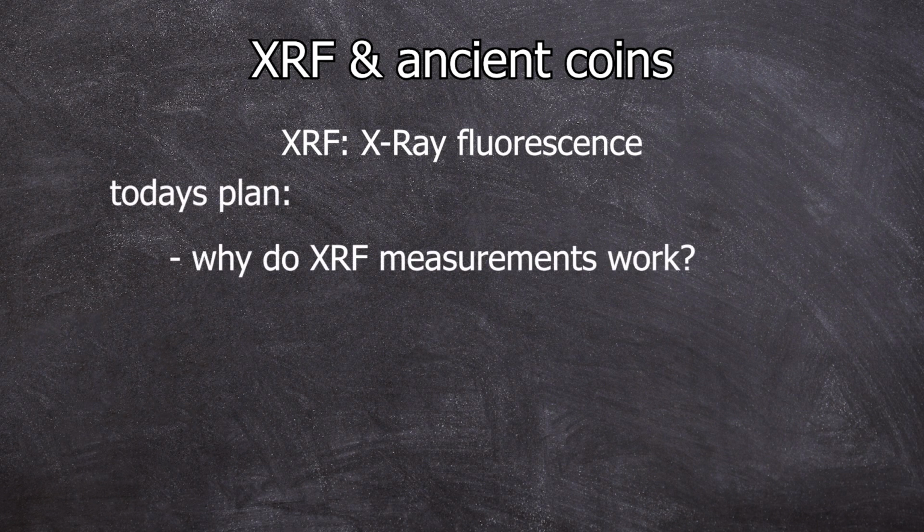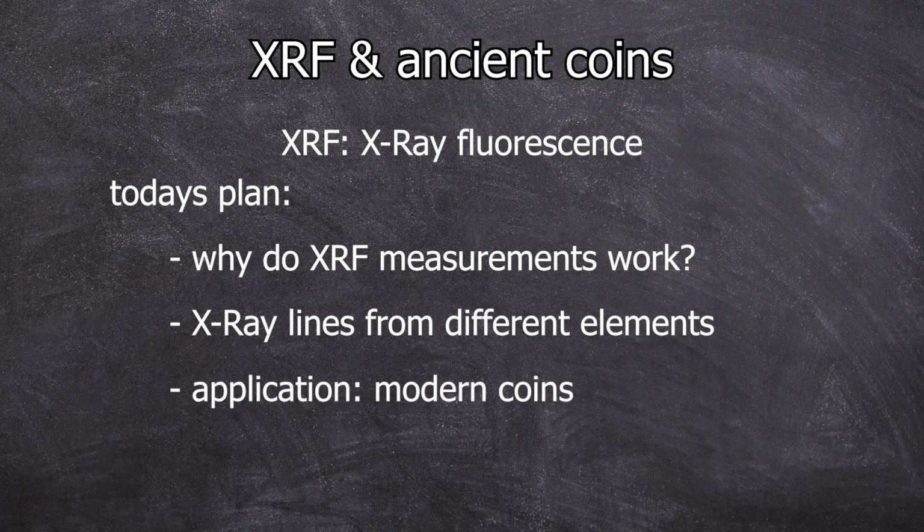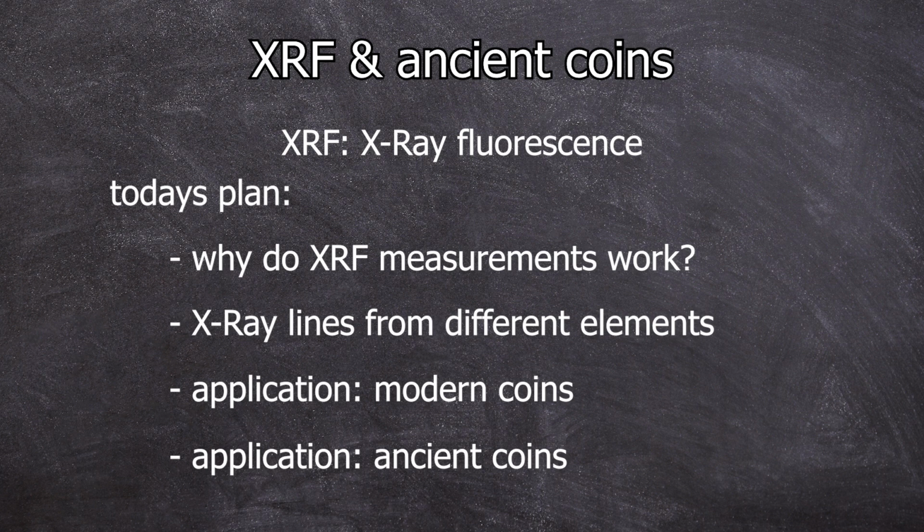First, I'll introduce the measurement method and using pure elements. Then we'll move on to the composition analysis of modern coins, and finally, we'll take a look at the XRF as an analytical method for the often complicated metal alloys of ancient coins.